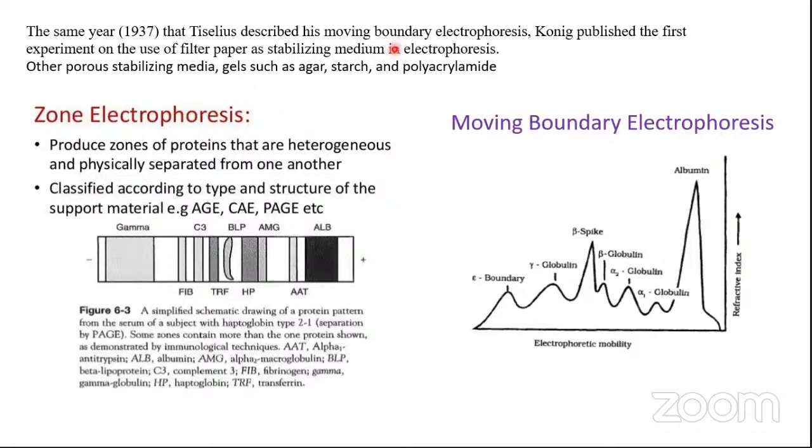During electrophoresis, as molecules are charged, the electric field influence will dominate. Yes, very correct. So diffusion will not be the point of concern during electrophoresis. That's what you're trying to convey.